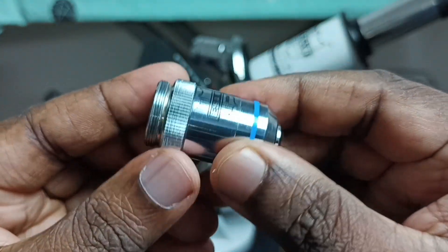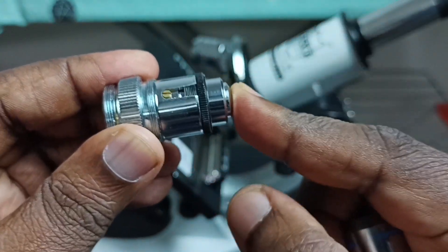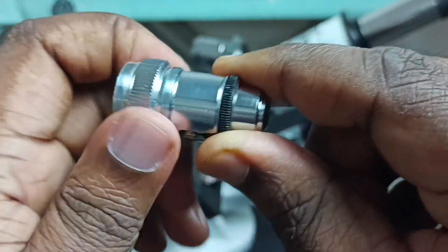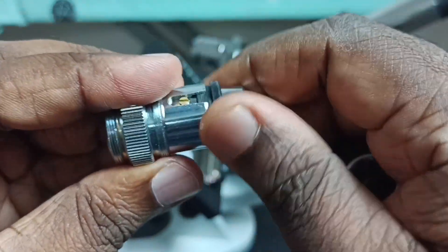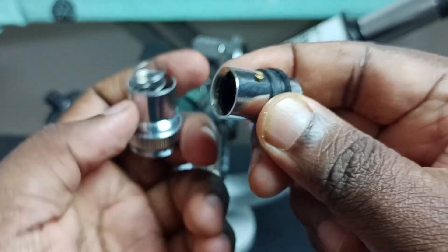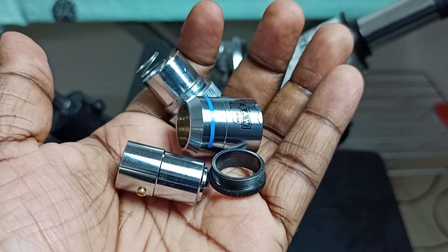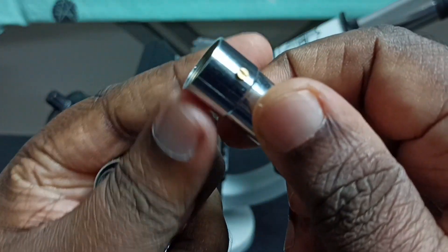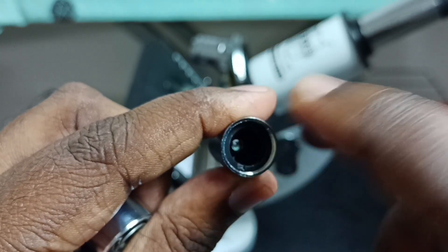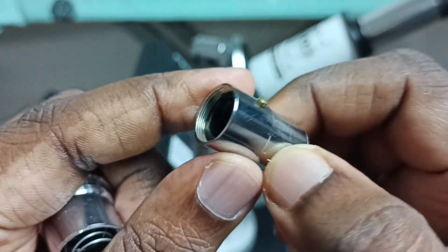This is the objective lens. Let me open it. There is a spring inside — let me remove this plastic part. These are the parts; this is the lens. We can remove the screw, then remove this plastic. We can rotate it and take that plastic outside, then we can remove this lens. I will show you how to take this outside.